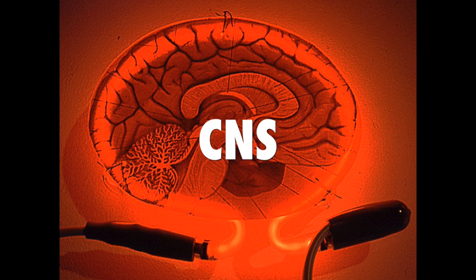Now let's move to the 11 slides for the central nervous system. We have 11 slides.